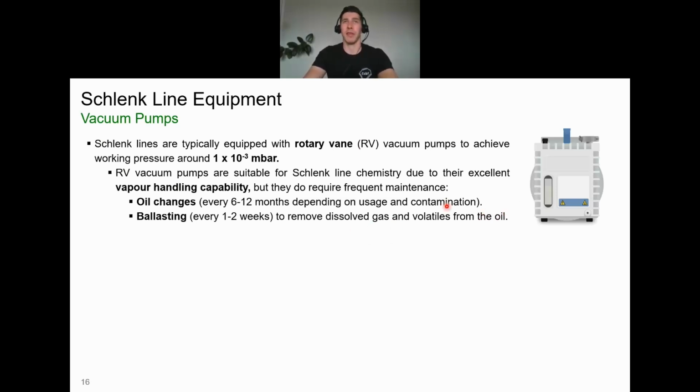If you're ever working with large quantities of pentane, ether, dichloromethane, or low boiling solvents, then it's very beneficial to ballast your pump at the end of the day or the start of your day to ensure that it is operating as well as possible for your next applications.